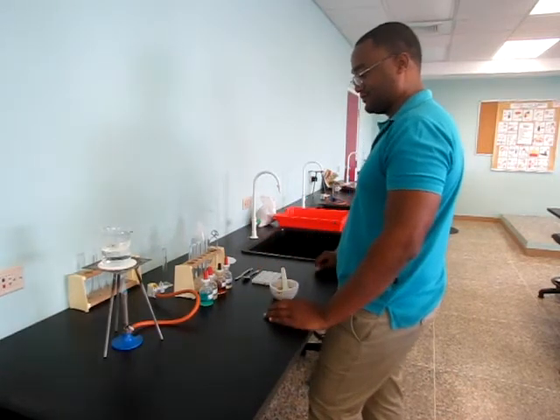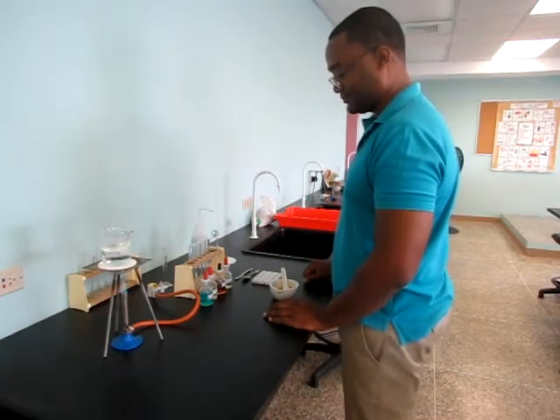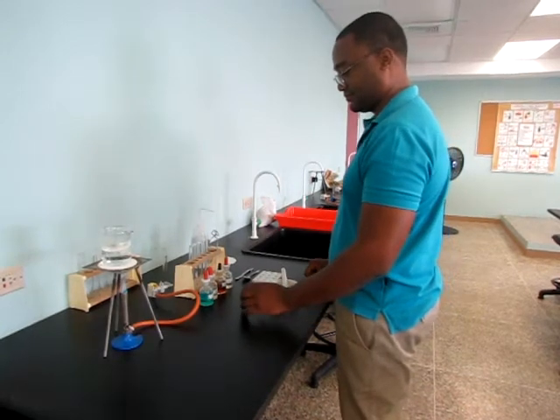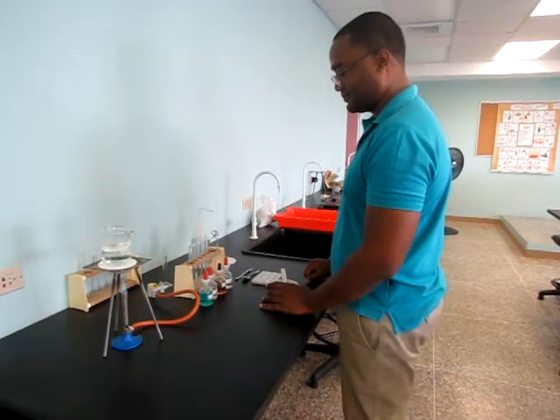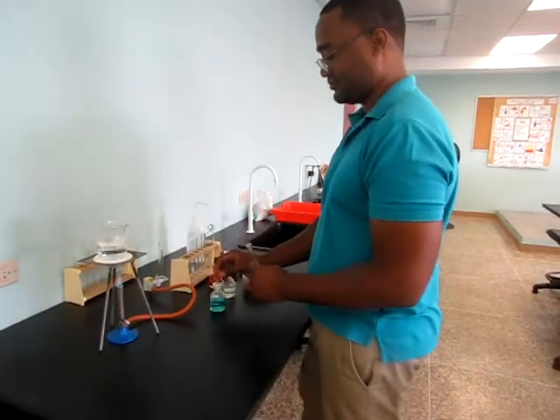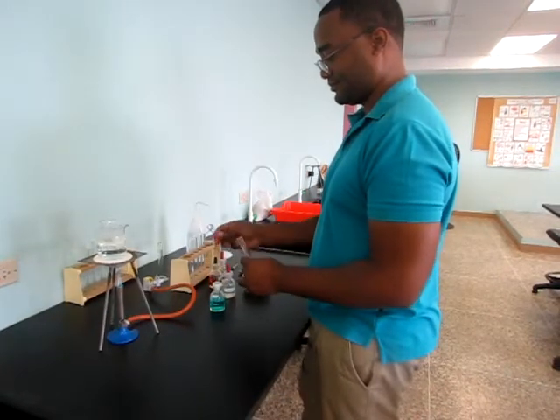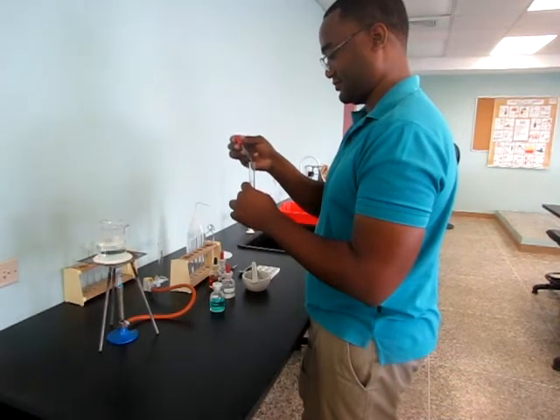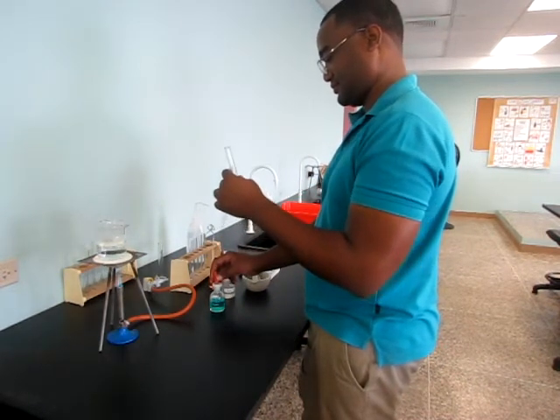Firstly, we are going to attempt testing for protein, which is the Biuret test. The first step, Mr. Neves is going to grind the sample finely. We are now going to pipette drop by drop of the copper sulfate solution into the same test tube.